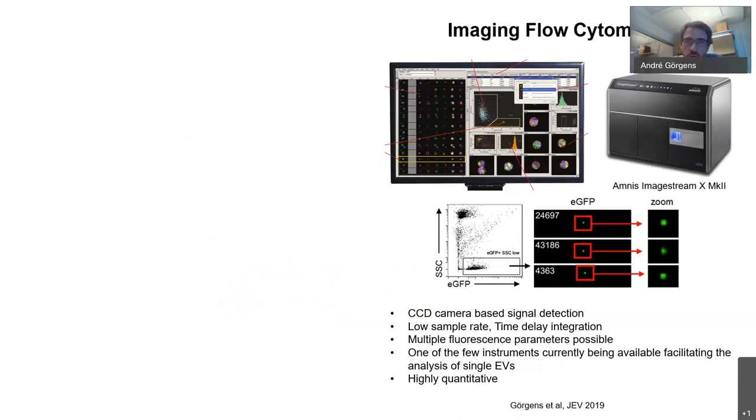And now I want to talk a bit about imaging flow cytometry and our experiences there. This actually started when I did my last postdoc in the lab of Bernd Giebel in Essen in Germany. And there we were lucky enough to have an Amnis ImageStream instrument available, which I will come to in the next slide. So let me just quickly mention it.